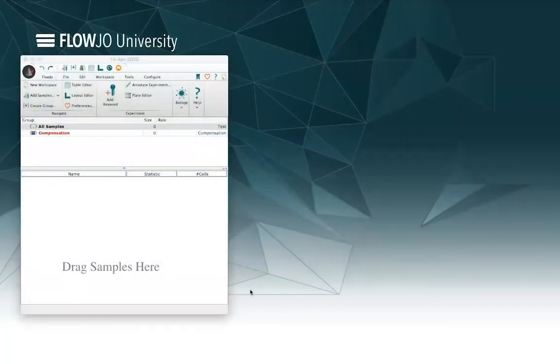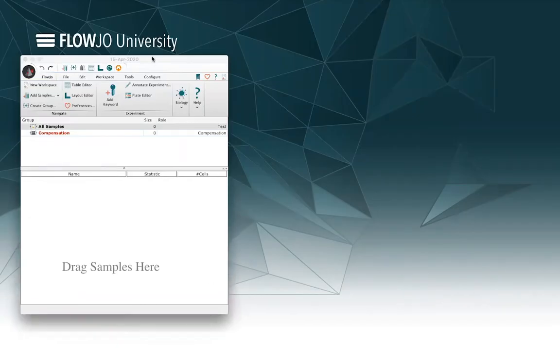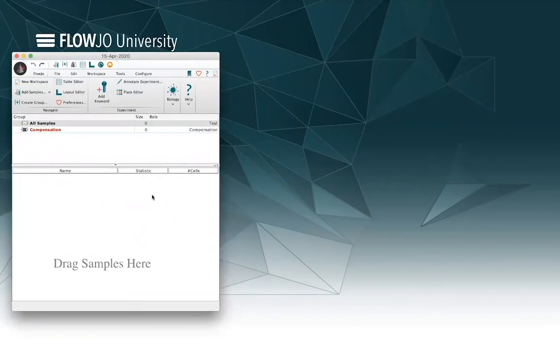Greetings. Welcome to another FlowJo University webinar. My name is Ian Taylor, Director of Product Innovation here at BD Life Science Informatics. Today I'm going to be talking to you about traditional compensation. To get us started, this is the FlowJo workspace. As you can see, I've got no samples loaded here, so let's start by adding some samples.